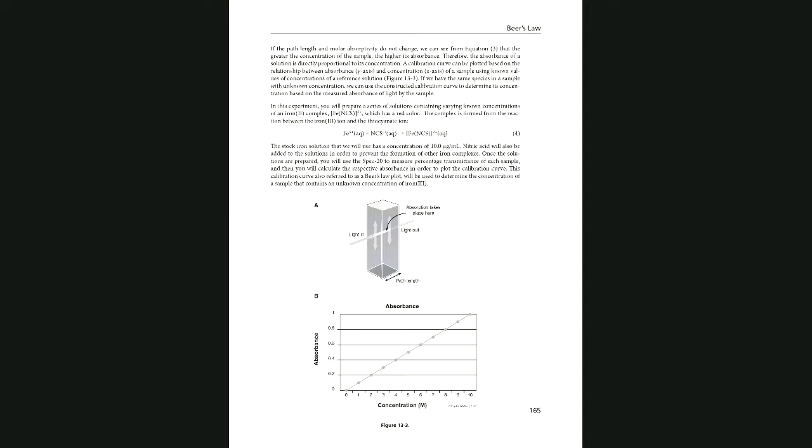I'm going to perform this experiment in a way that lets you record your data. Based on the data values, you will be able to complete your data sheet to turn in as an assignment, because you cannot be here to do the experiment. I'm doing it so you can have your data values.